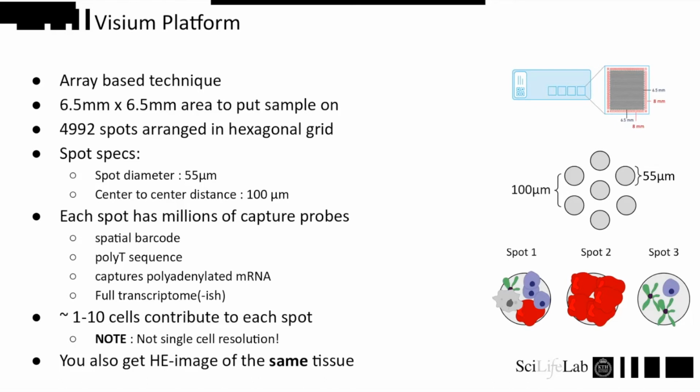That might seem not very relevant if you're only interested in the transcriptome data, but it's an extremely valuable reference resource. I spoke with people in the group that developed the SlideSeq data, and they sometimes experience a bit of frustration not having this reference image to see whether it makes sense or not. So getting an H&E image is very valuable in most cases, and pathologists tend to really like it as well.